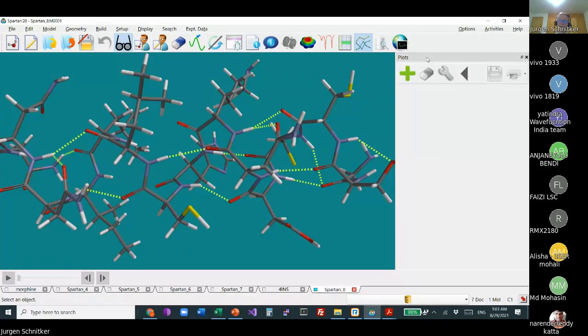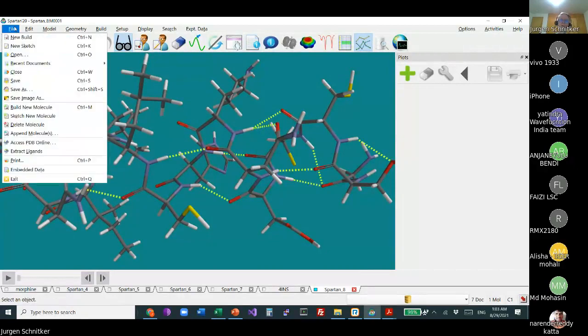Okay, and so this would be okay. What does this machine spit out? The spectra, or what does it spit out? Crystal data. Not molecules from the CIFs, the crystal information file from the XRD. Okay. And we have the molecules from the CIF. Okay. And other molecules from Spartan.